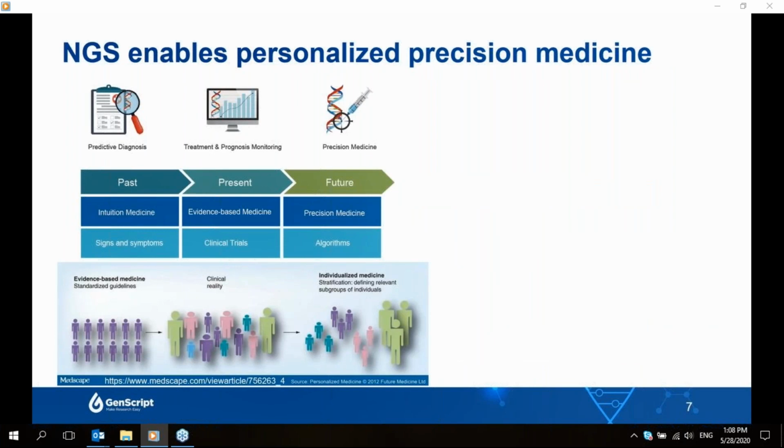So we just quickly went over some technical background of NGS in general. So in terms of its application, I think everybody would have their own opinions. But for me, with a human disease and genetics background, NGS is a really powerful tool to search for low frequency mutations and do that in a large population very easily.